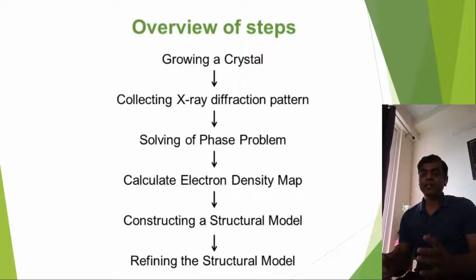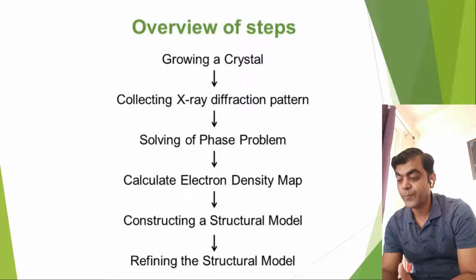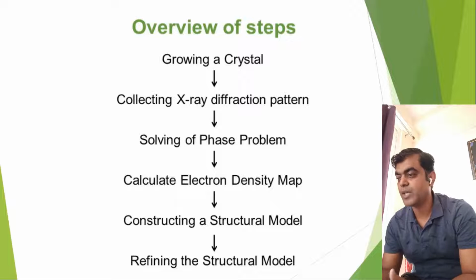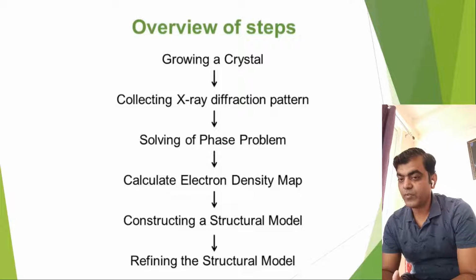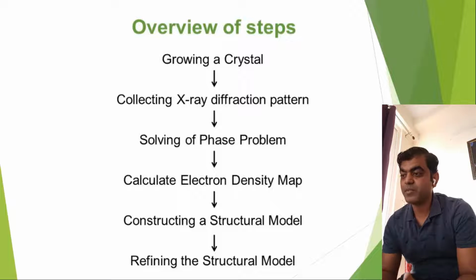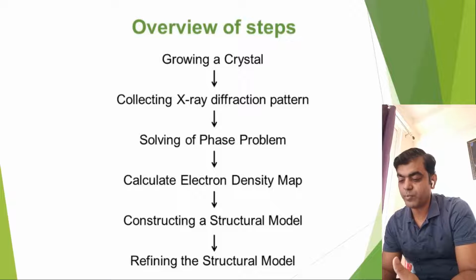But in this process, what are we getting? We had a wave, we saw the wavelength, we saw the amplitude of the wave. When two waves of the same phase match with each other, the amplitude doubles. That is constructive interference. When two waves with a difference in amplitude or phase come together, then there is a negative or subtractive effect, and it becomes destructive interference. And these patterns of constructive as well as destructive interference are what we get.